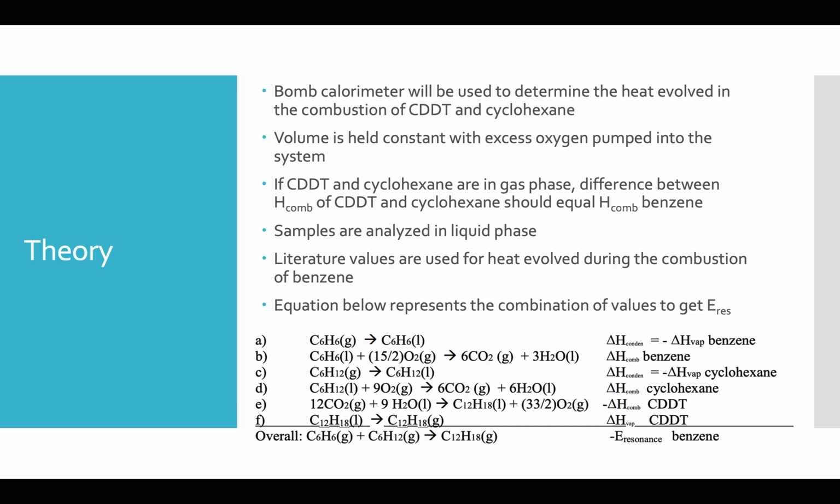The bomb calorimeter is at the center of this experiment. In the instrument, the volume is held constant while oxygen is pumped into the system. The result is an oxygen-rich environment at high pressures. With the sample molecule inside, a fuse vaporizes the sample and ignites a combustion reaction.